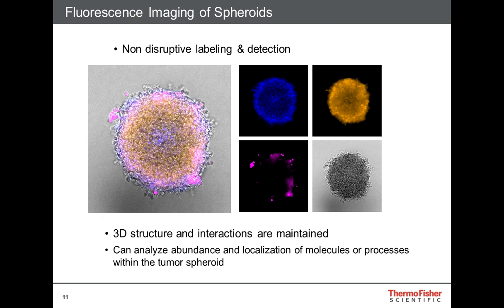So two things that are critical, counting our cells and then using an appropriate plasticware to grow a nice round spheroid. And so now when it's time to image these and evaluate the biology occurring inside these three-dimensional structures, fluorescence is really ideal because it provides us a way to not only label our cells and distribute a dye throughout the structure to report different functions, but to detect light given off by that sensor.